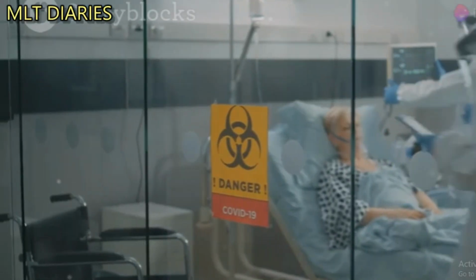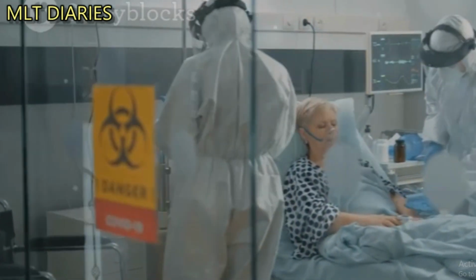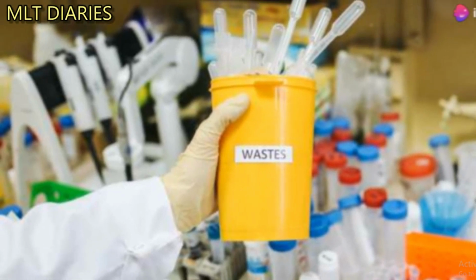Emergency procedures are crucial too. They outline steps to take in case of spills, exposures, or other emergencies. Lastly, waste management guidelines ensure that you dispose of lab waste properly.